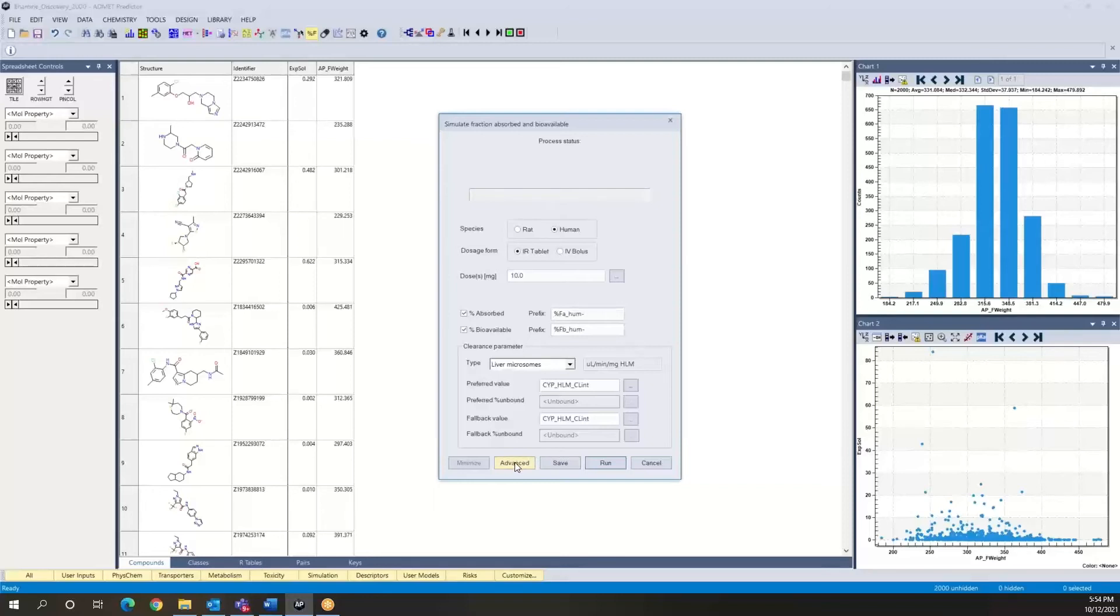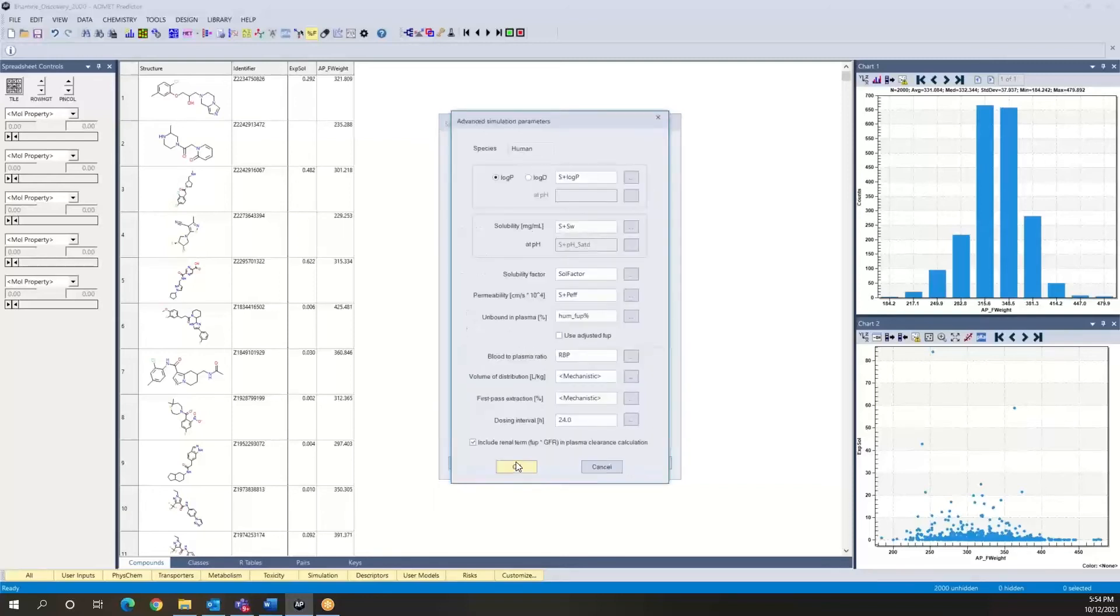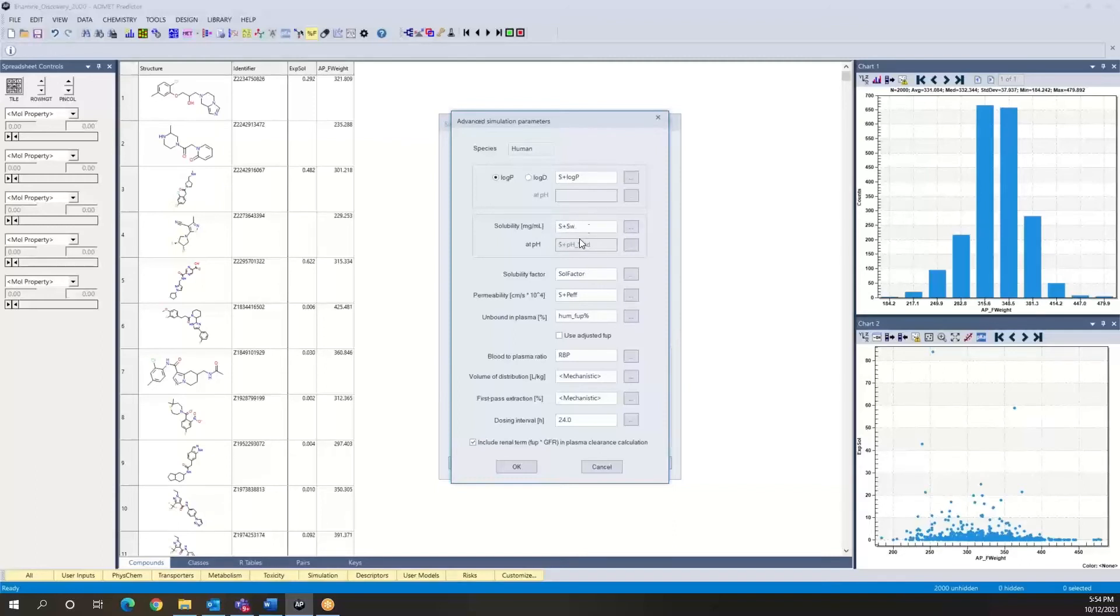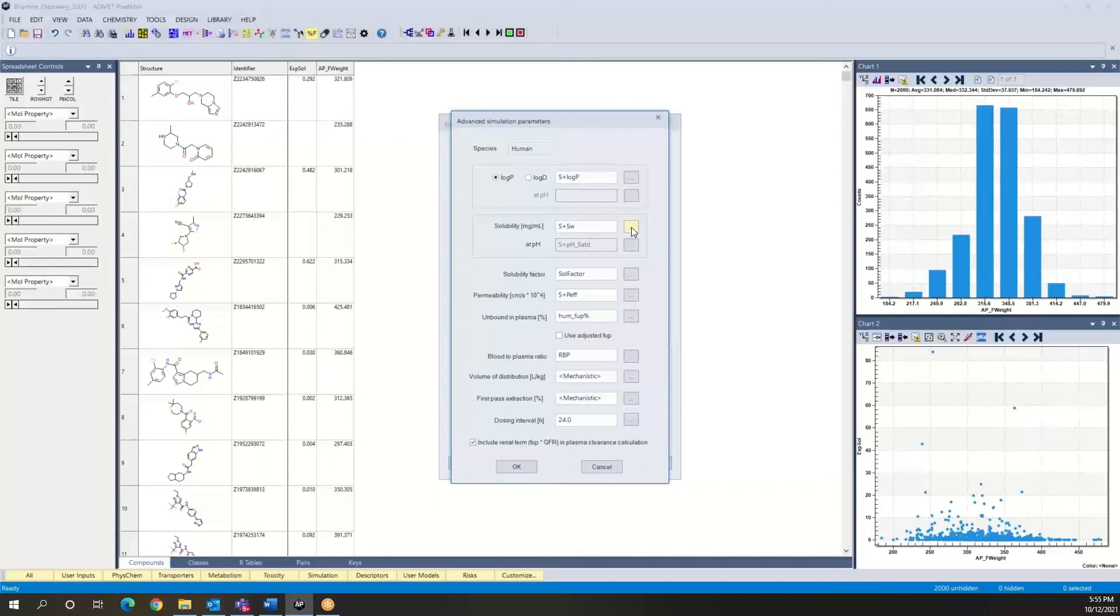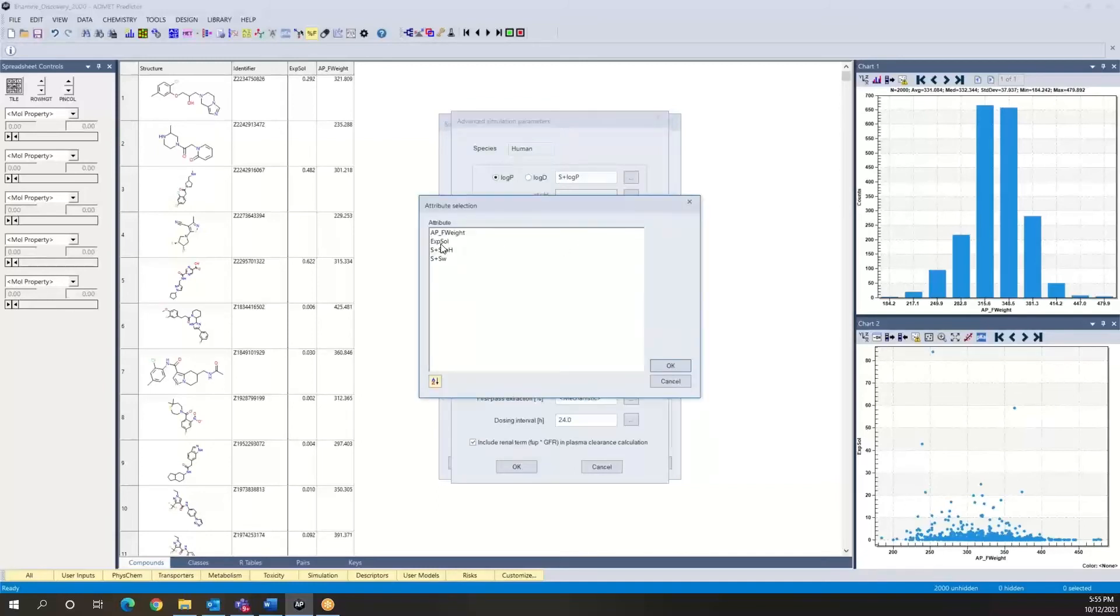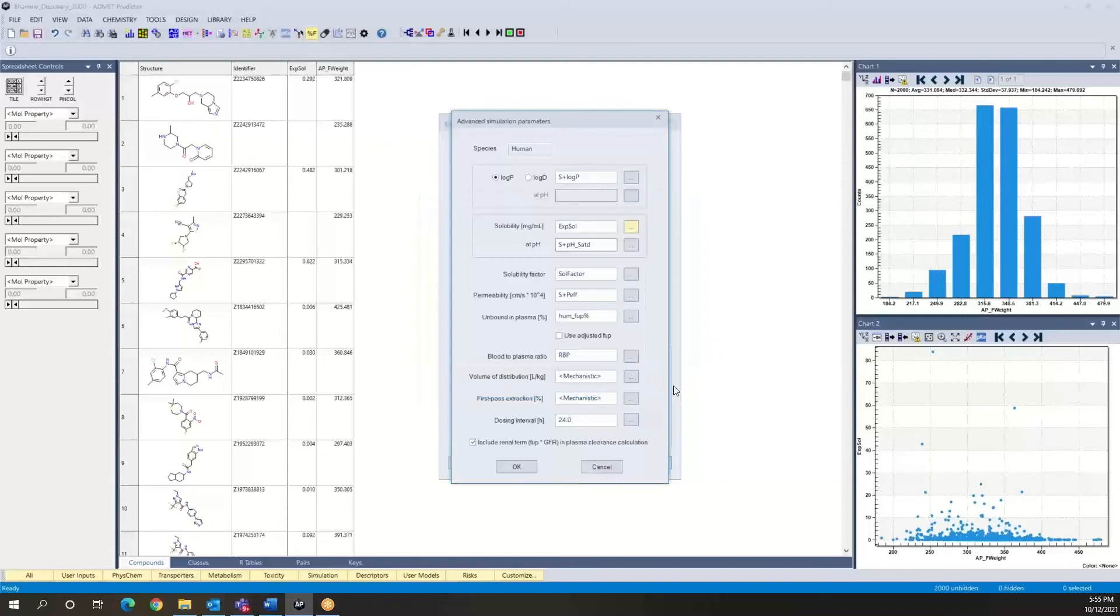The way you do this is by going into the advanced settings. So, again, by default, the software is using our native pure water thermodynamic solubility model. Now, what we can do instead is point the software to this column. That's what those little three dots here are for. This little side box. You can click on this and then select this column as the attribute selection, this experimental solubility column, and just say OK.